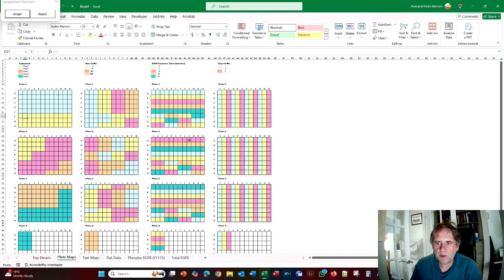Compound 3 will fit happily on that plate. And then compound 4, we would also need to eliminate 2 time points, so it would fit nicely into here. And then finally compound 5 will just occupy plate 3 on its own in the top half of the plate. So if you're not following that, don't worry, because you're about to see it actually happen. We're about to do that with the platemaker wizard.